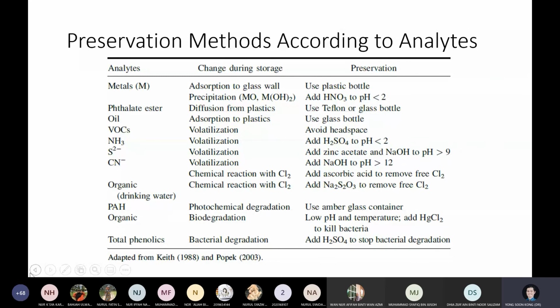It's not too late because you're learning in environmental sampling. So don't tell me you don't want to learn this lah. You must, because you want to call yourself environmental technician, kan, you're going to go out and collect samples, water samples. These are the things that you wajib, you have to know. What are the preservatives that you should use? So if I say you have to know, that means it's coming lah in your test and exam.